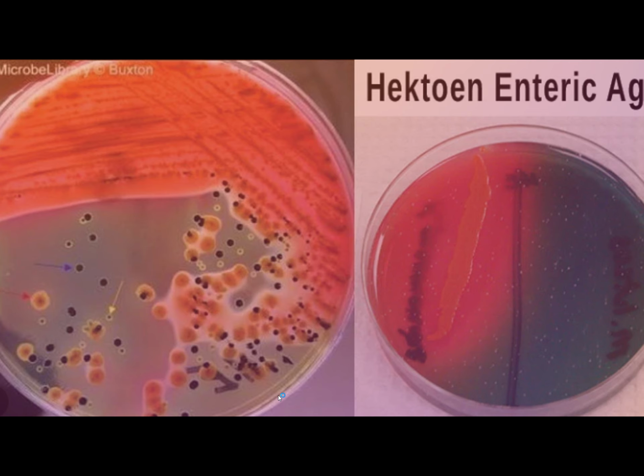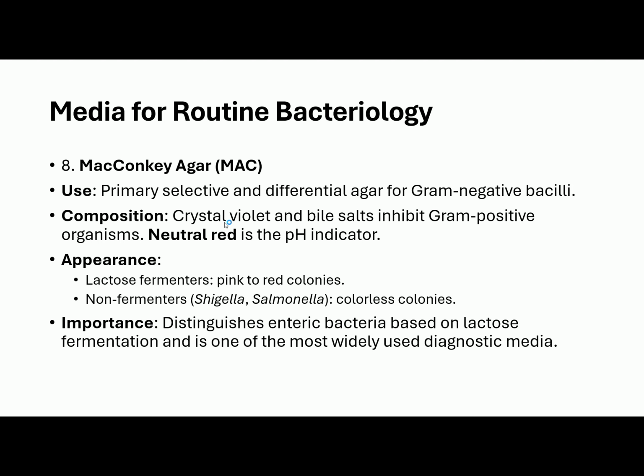So ito yung HEA nyo. So if you take a look at this, class, yung may mga growth dyan na black yung center, these are usually your Salmonella. It produces hydrogen sulfide.